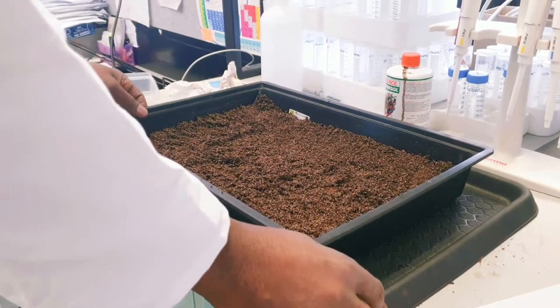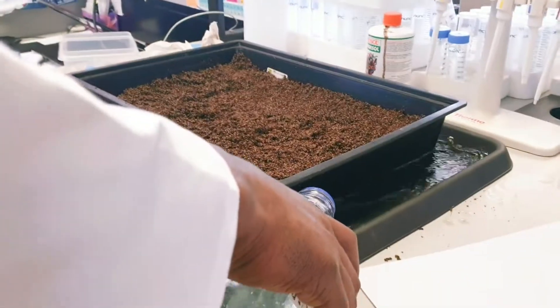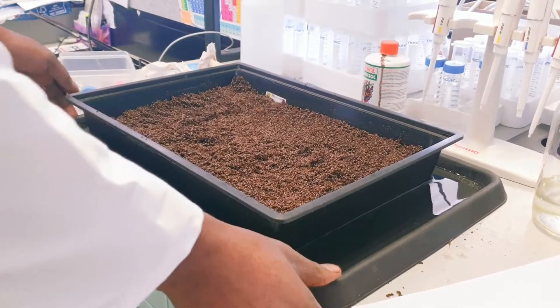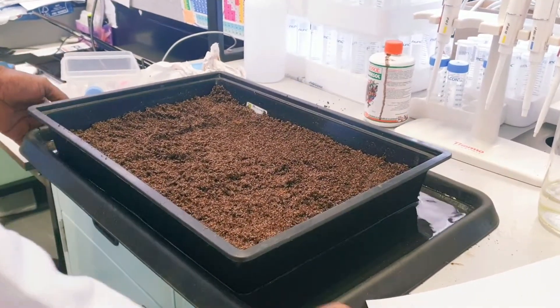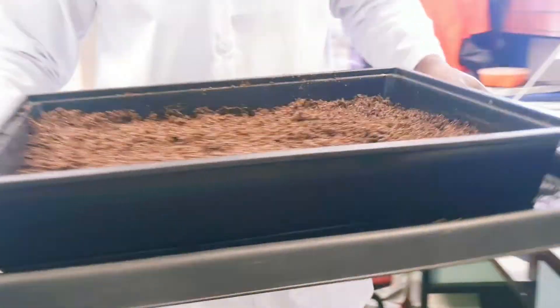The next thing is to pour water here. You don't want the soil to dry out — you have to allow your seed to germinate. So I'm going to pour the water and then drop the tray in our plant room.